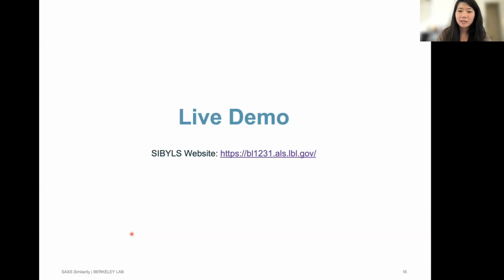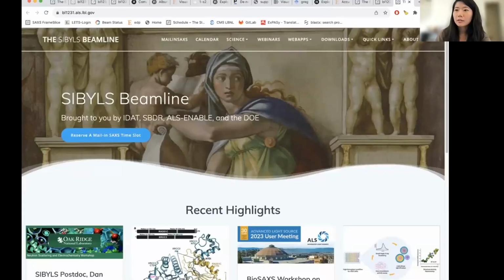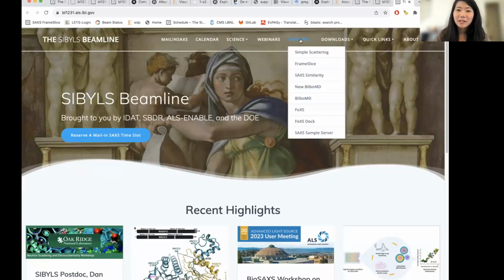So I am going to start the live demo section. I have the link to the SIBYLS website, but you can always Google it and it will take you to our website. And I think I have to reshare my screen because, there we go. Okay. Let me also know if I'm going too fast, or if you have any questions, just interrupt me, it's fine.